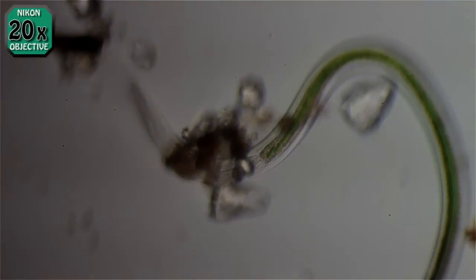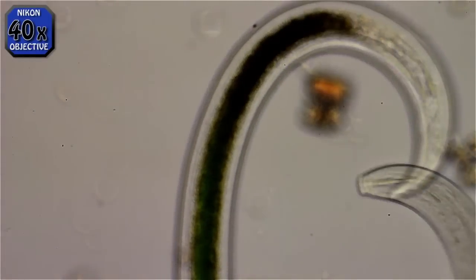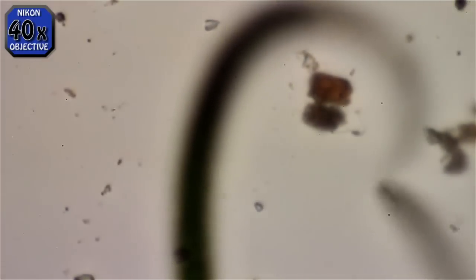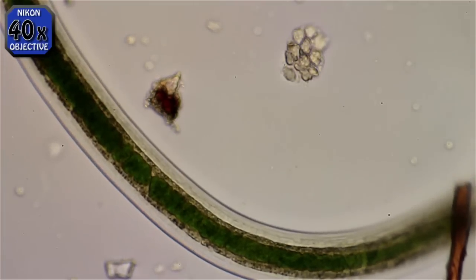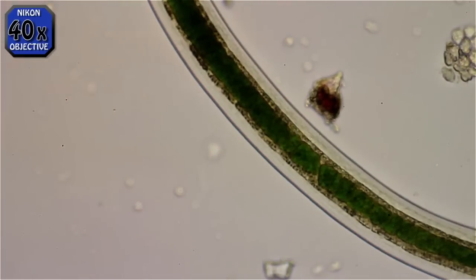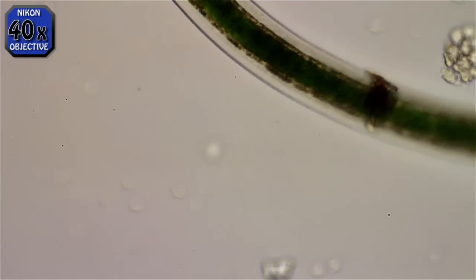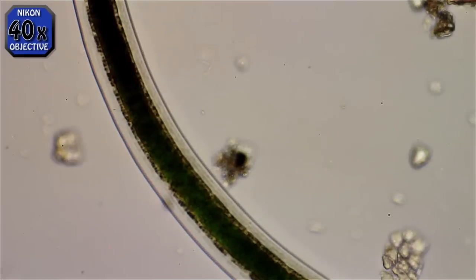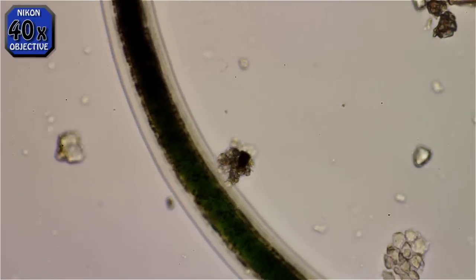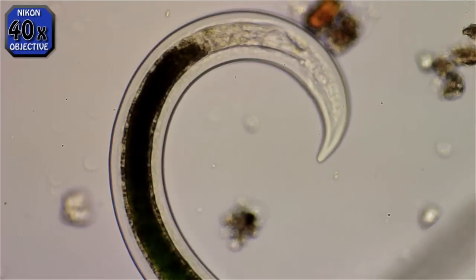In a single drop of sample water you can see why it's called a hookworm. This is an adult, and this is also the first one I've ever seen with anything green in its gut. Apparently it's been dining on the moss or algae that might be growing in the moss. I've never seen it filled with green before — it's always been a brownish gray, maybe a golden color.